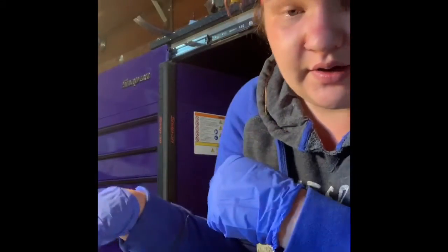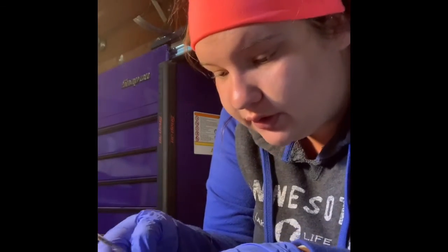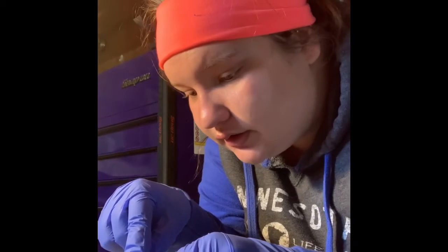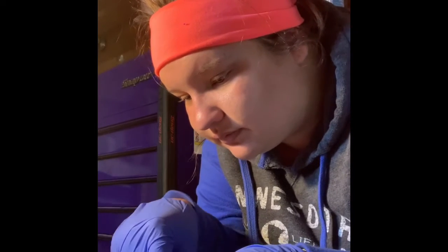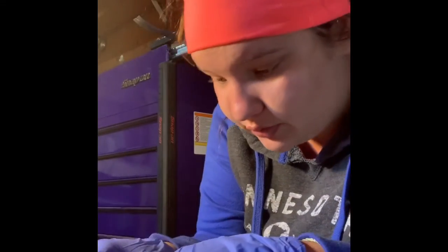I'm going to be cutting the brain again. That way I can try to get to the cerebral cortex and expose more. So I'm just going to cut right in. There we are. I'm just going to pause quick and pick up my camera to show you where I'm at. Got a really good view here.